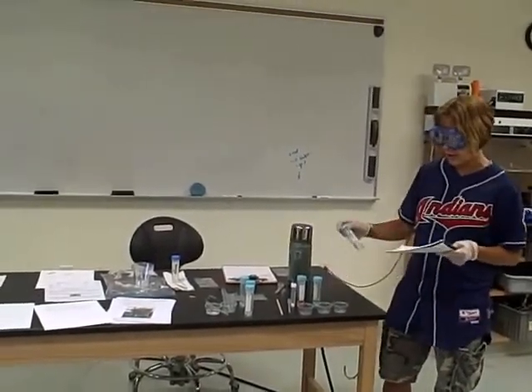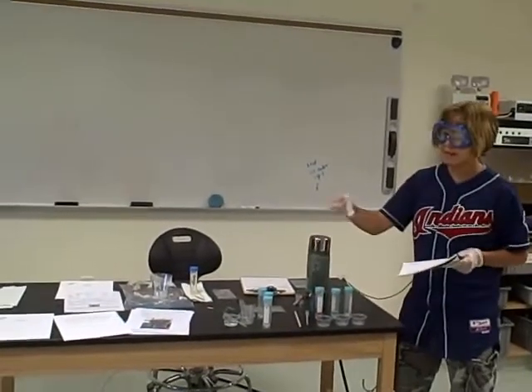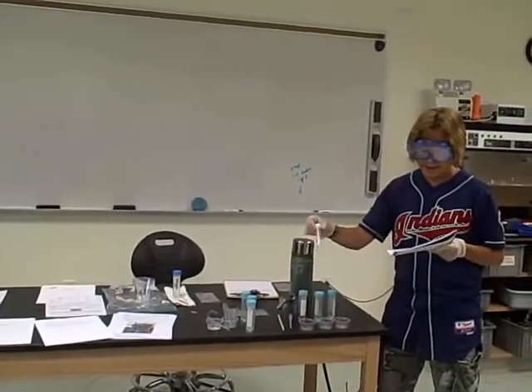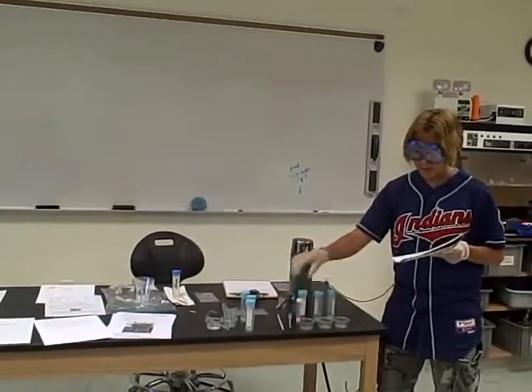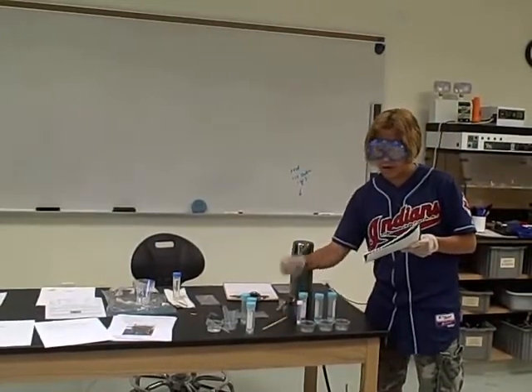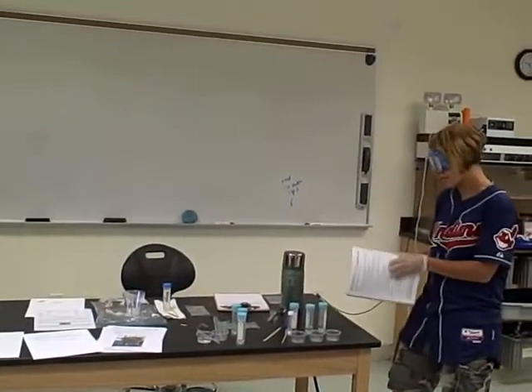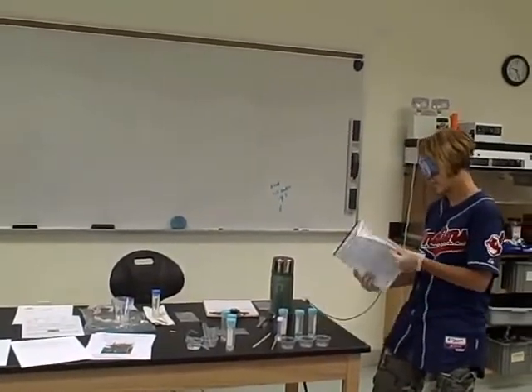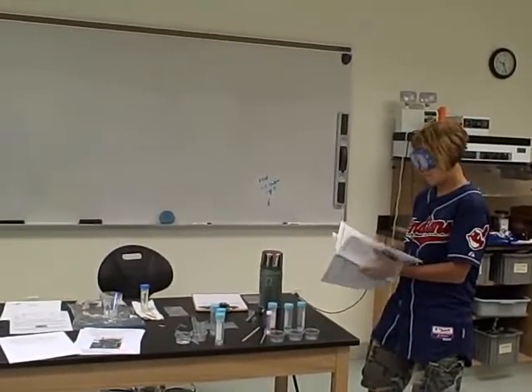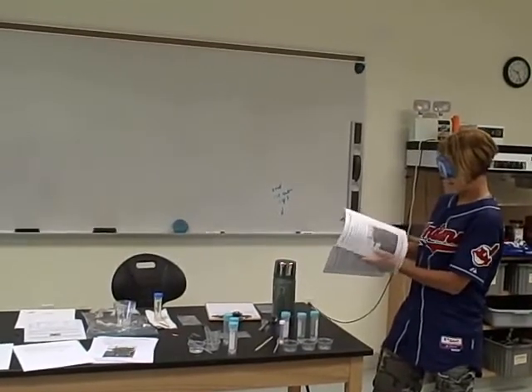There's also a vial containing water, that's 10 mils. There is a tiny vial of sodium borohydride, that's marked S. It's the only solid in this experiment. We've got 3 little cups that are marked, and then a stirrer and one of these barrel or dropper pipettes. So as far as illustrating this, experiment one more handy than this.